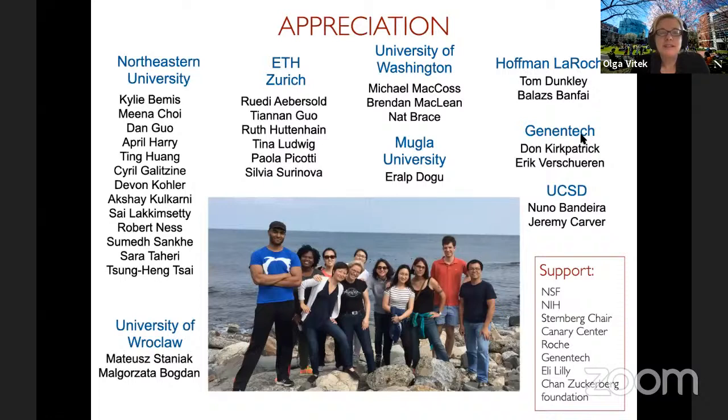I would say that without knowing more, what statisticians would always do is to have a pilot study. And it is always a good idea to have a small scale pilot study just to understand how much carryover there is. And so you can have two versions with and without the blanks in between and try to understand what the implications are. And usually for this type of pilot studies, we like to work with some samples where we have a sense of the ground truth, such as controlled mixtures or spiking experiments or some biological samples with known biology, so that you can characterize the extent of carryover.